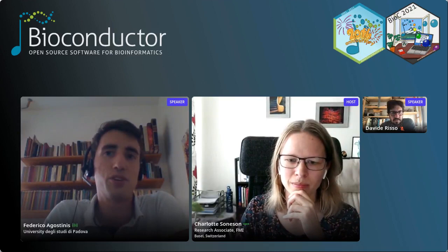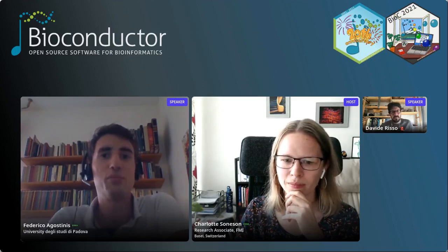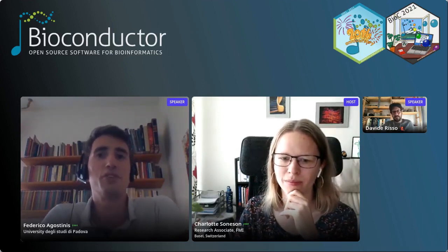Yeah, okay. I think that choosing the right number of variables is a tough task for every factor analysis, and I do not have the best number of K for NewWave. I suggest comparing it to the number of genes.